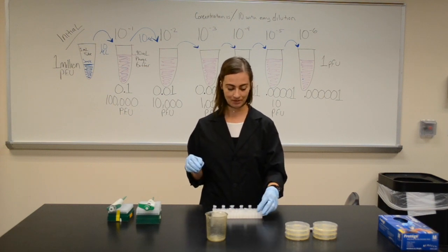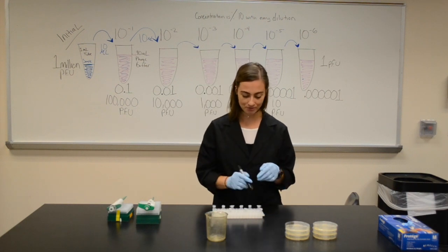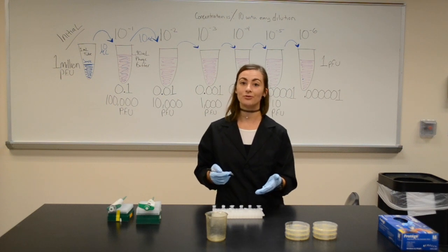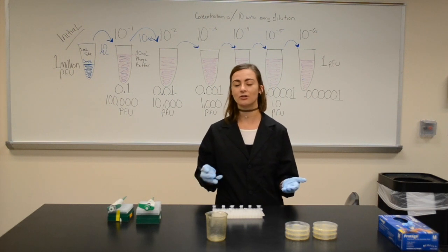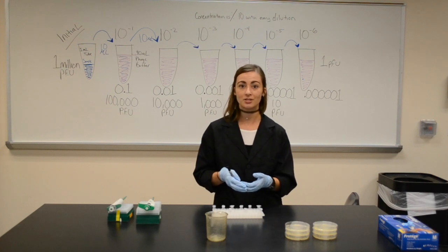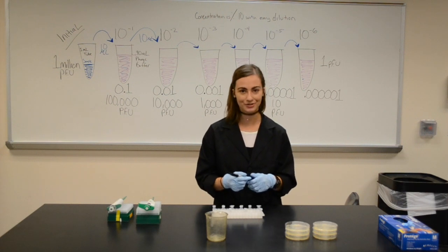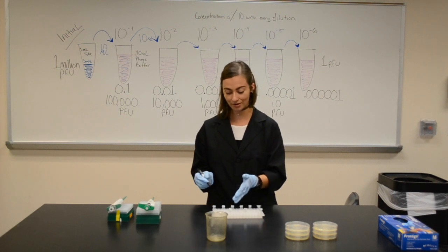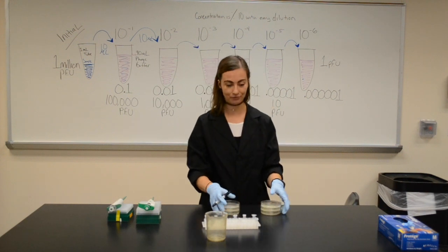We have our phage buffer which will already be aliquoted out for you. We have our bacteria, and I have my six tubes out. What's important with the tubes is to label them. Once you start going, if you didn't label, you're not going to know what you have and you're going to have to start over from the beginning. I've forgotten to label before and let me tell you, I won't do that again. I'm going to label my tubes 10 to the minus 1, 10 to the minus 2, minus 3, minus 4, minus 5, minus 6.